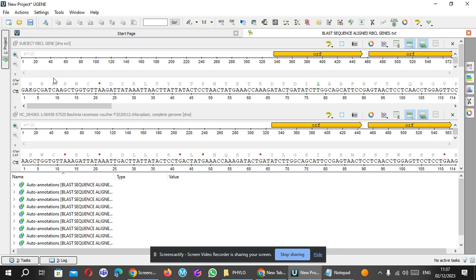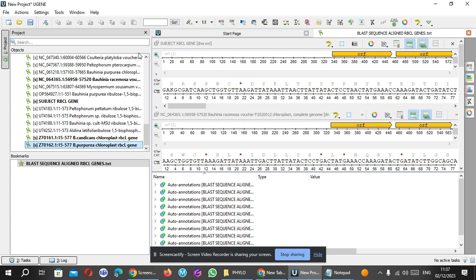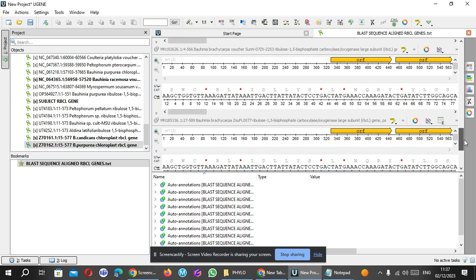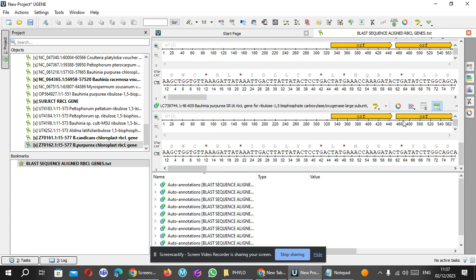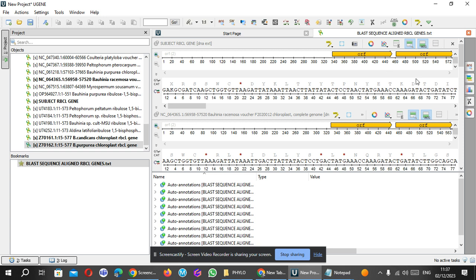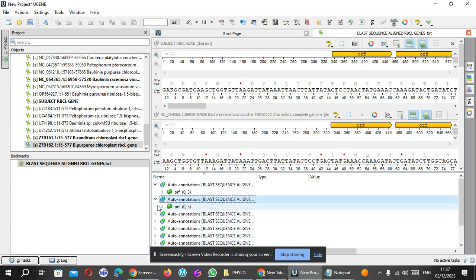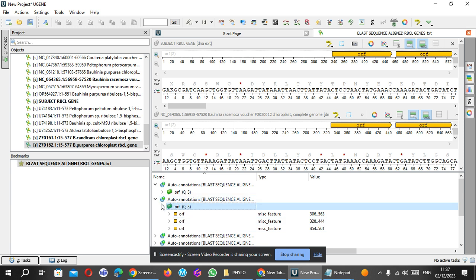So these are the sequences. There are 51 like that. This is the reading frame area where we can see the open reading frame. If you notice, most of them have their open reading frame at the end side of this amino acid sequence, and information about the open reading frame is here. If you want to check it one by one, we can see information about the length here, but that is not where we are going.